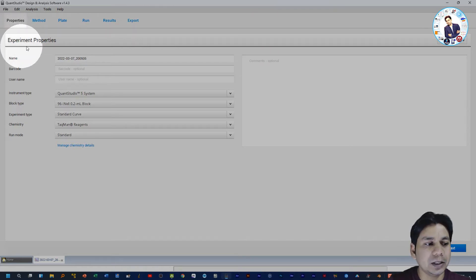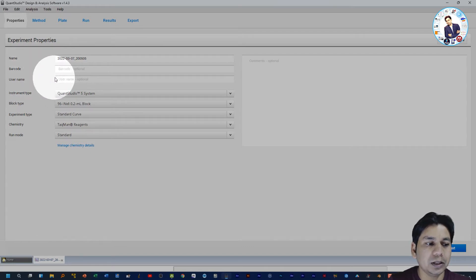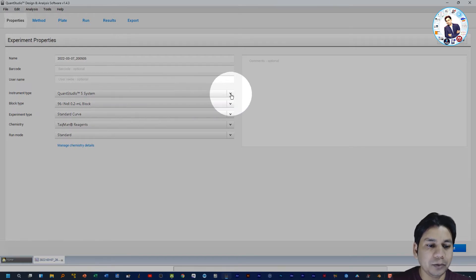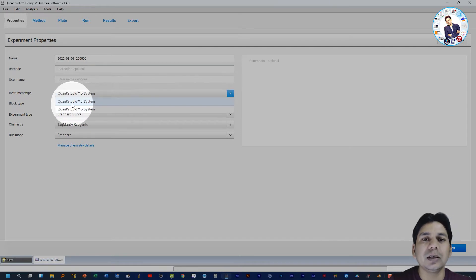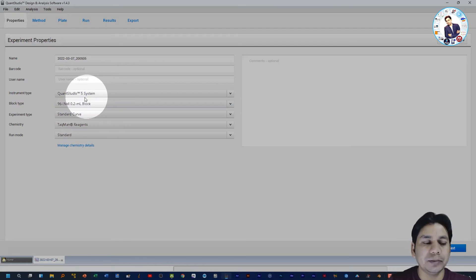In the Properties section you can see Name — you can rename your experiment — Barcode, and Username, which are optional. For Instrument Type, by default it is QuantiStudio 5, but if you want to change it you can select from the dropdown menu. This software can also be used for the QuantiStudio 3 system, but I am selecting the QuantiStudio 5 system.